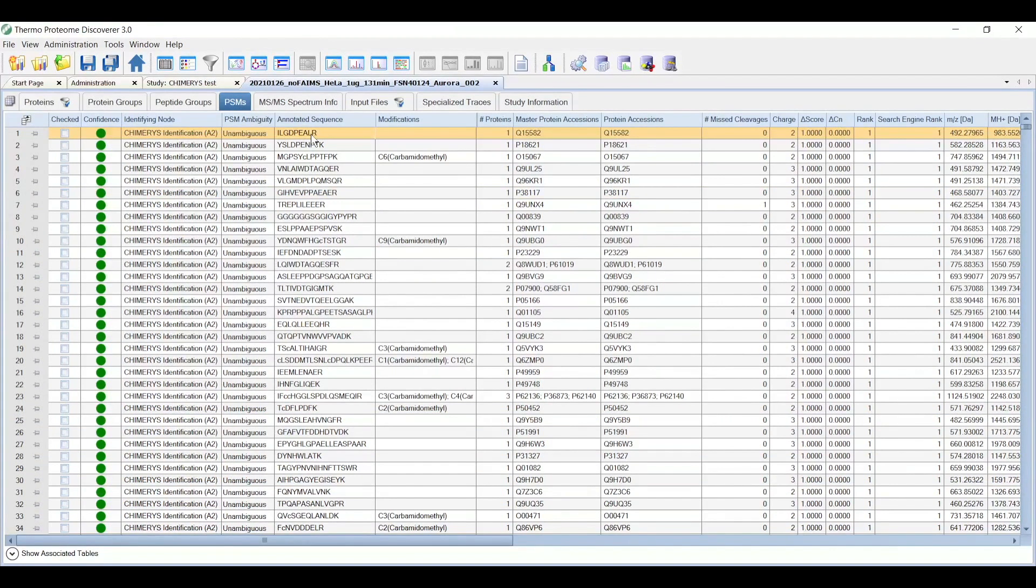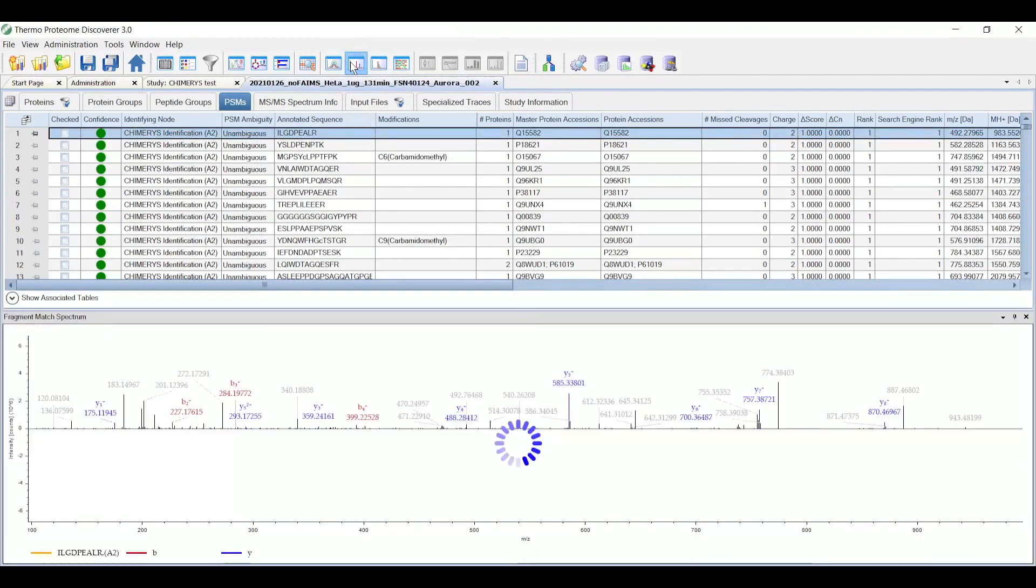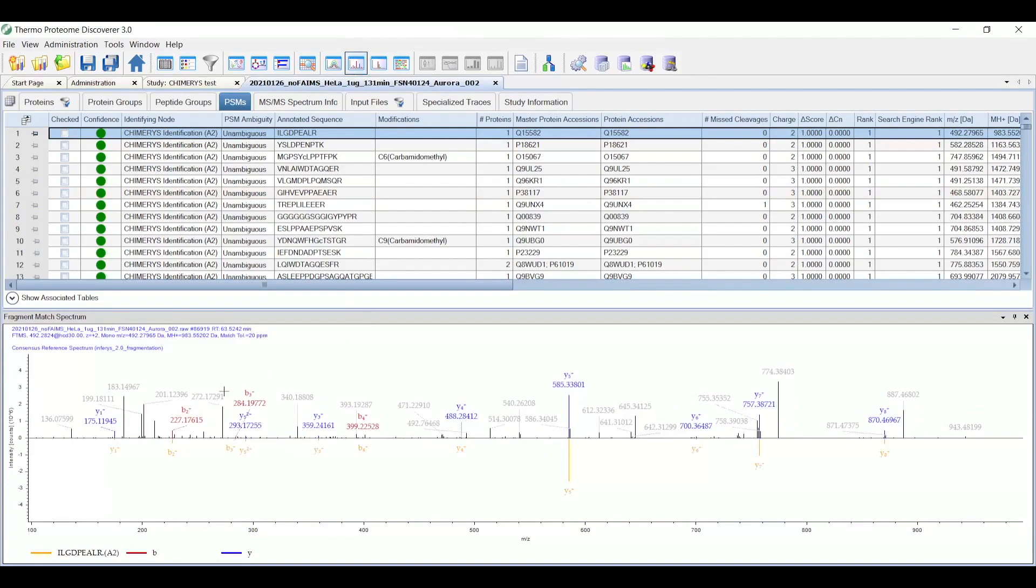If we would like to view any of the annotated spectrum in the result, we can open up the fragment matched spectrum view, like here. You can see here's the experimental spectrum up above, with the annotated peaks in that spectrum.